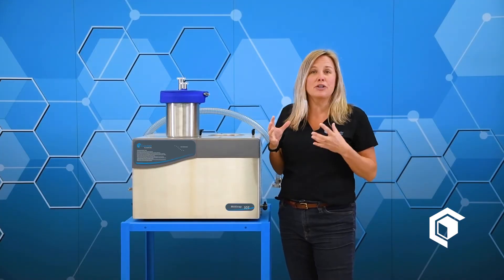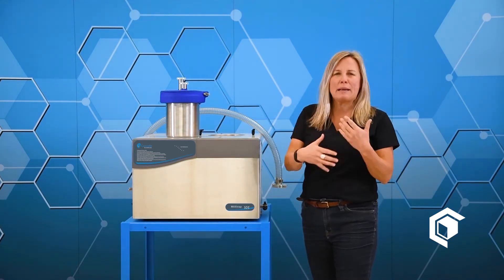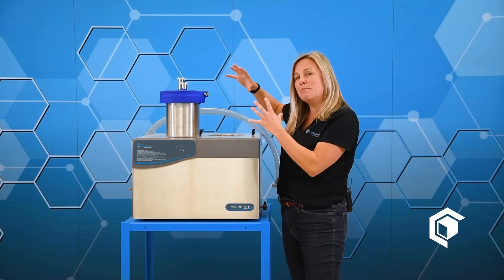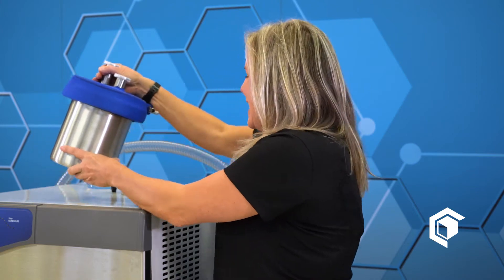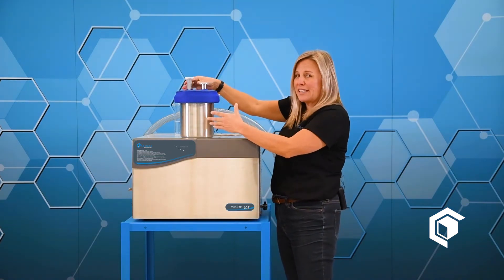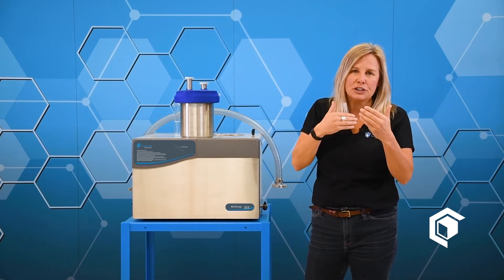Our next very popular Cascade cold trap configuration is the max trap. This is more often paired with a vacuum oven — preferably a Cascade Sciences vacuum oven — and it's really designed for high production vacuum cold trapping. The max trap comes with this cold well right here, which is a stainless steel insert that goes inside the refrigerated mechanical base. It has a ton of surface area inside for high throughput, high production trapping.